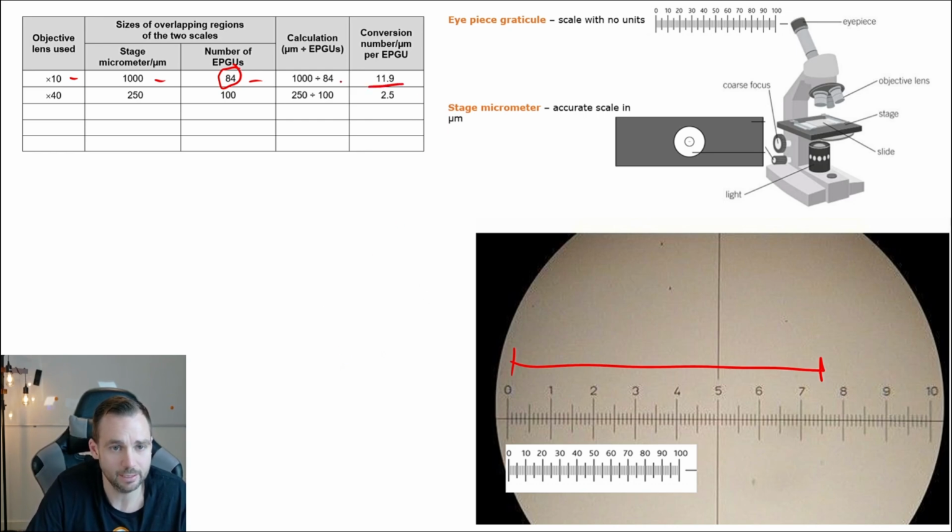So previously, the example I gave, that was equivalent to 100, so it's really significantly out, nearly 20% out, this lens. Now just to give you some general ideas, if you're starting your PAGs on this, regardless of which one you do, in the 1.1, 1.2, 1.3, and if your school makes any extra themselves, these are the rough numbers that you're going to see.